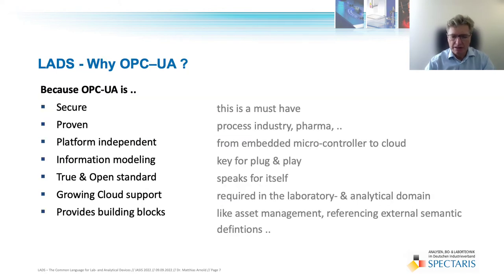When we started the LADS initiative, we did not want to reinvent the wheel. We wanted to build our work on a proven and secure foundation. So why did we choose OPC UA? Because OPC UA is secure. This is a must-have. OPC UA is proven.